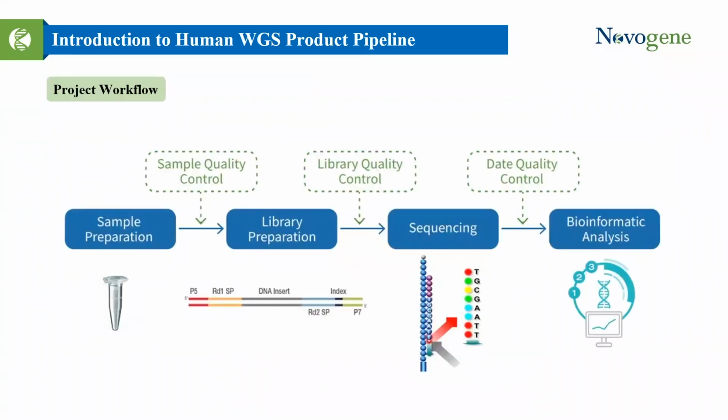In this figure, you see how our project workflow proceeds, from sample receipt and library preparation to the generation of the final data. Now, I'm going to introduce the pipeline step by step.